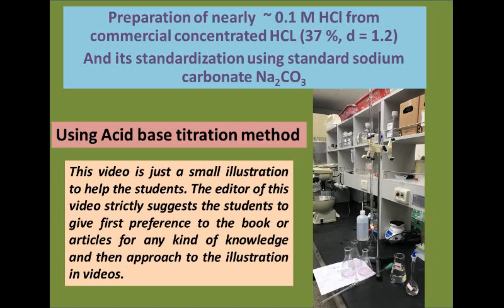For the standardization of acid, we need to prepare acid solution of certain concentration. So, in this illustration, we will prepare hydrochloric acid of around 0.1 molar concentration using concentrated hydrochloric acid that is available commercially. And in this case, we will standardize the hydrochloric acid with standard sodium carbonate. So overall, this process is a kind of acid-base titration method.